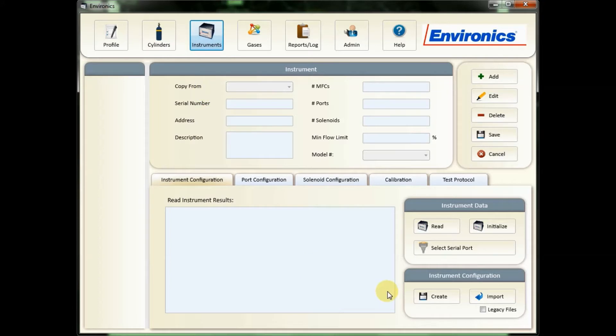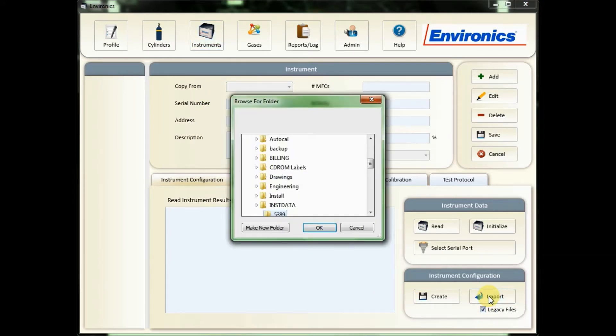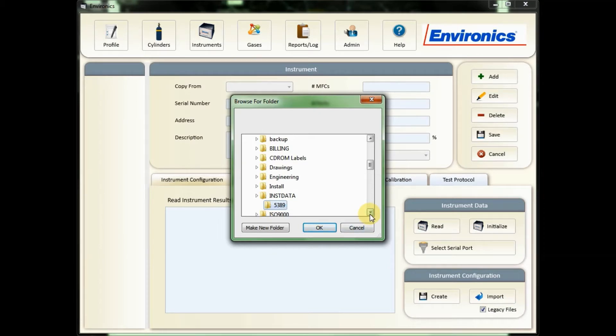From this screen you're going to click on the legacy file box and the import button. Make sure you know where your software folder is. Normally we provide that on a CD for new and serviced units, but you might have gotten an email. Just make sure it's all in a single folder.